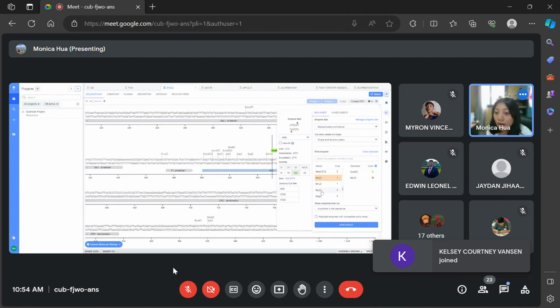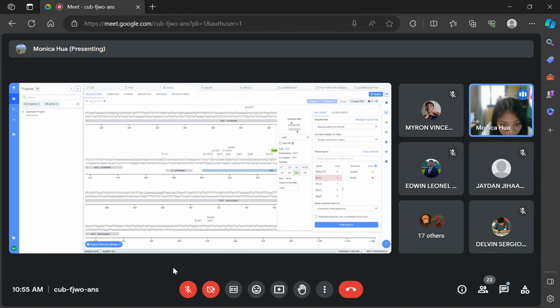For example, okay, all right. So I forgot to mention this important part of the lesson. Look at your restriction enzyme right now on pUC, okay? You only have that once, so you shouldn't have that site on your OD sequence. So now you observe it in your pUC or pIGZ or pCAMBIA, whichever one you choose, right? Now you're going to look at this sequence. How many cutting sites are on your sequence?